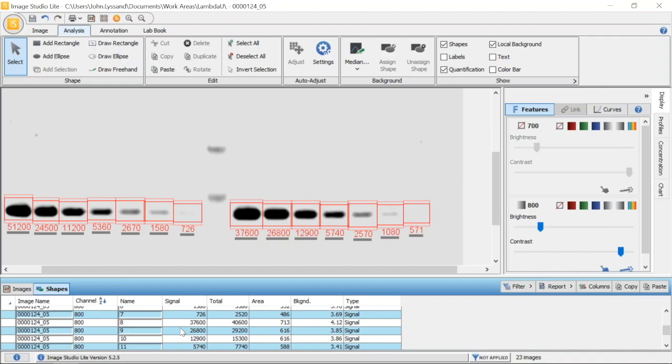Now, this value includes background and will change with shape size. To correct for background and shape size, we take into account the area, which is the shape size in square pixels, and the background, which is defined by the background method you set.